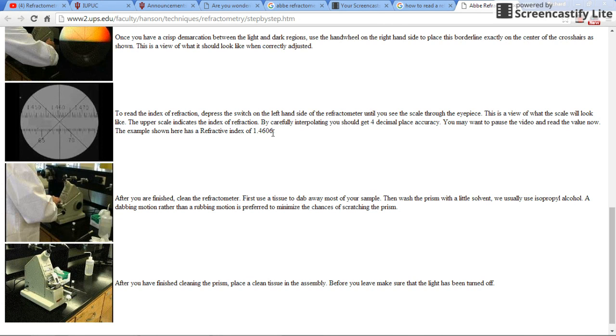We will use volumetric pipettes that only measure one volume. Fill it up to the line, release that amount into a tared bottle, and the amount of liquid that comes out should be your amount, and then your mass divided by your volume, since you'll know the volume from the volumetric pipette, should give you your density.